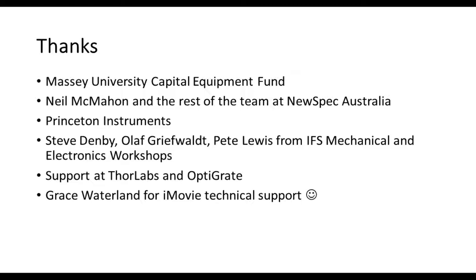We are open to answer any of your questions. I just want to add one thing to what Mark just said, which is imaging. If you are familiar with grating, the grating can be scanned. Once you put a grating at the so-called zero order, the grating basically behaves as a mirror. That's how you measure imaging: an image of a subject from a sample field. Then if you want to take a spectrum, you move the grating to whatever wavelength you're interested in, and that actually gives you a hyperspectral slice of the sample field.